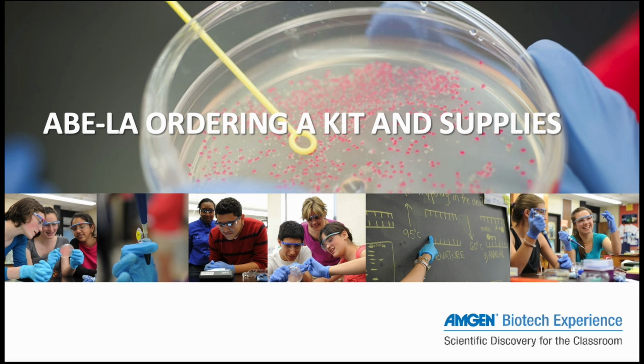In this video, we will review kit reservations, ordering forms, and kit return procedures necessary to obtain ABE equipment and reagents. This video is for trained ABE teachers who are planning to implement the ABE labs in their classrooms. There are 5 main steps to follow, so let's dive in.